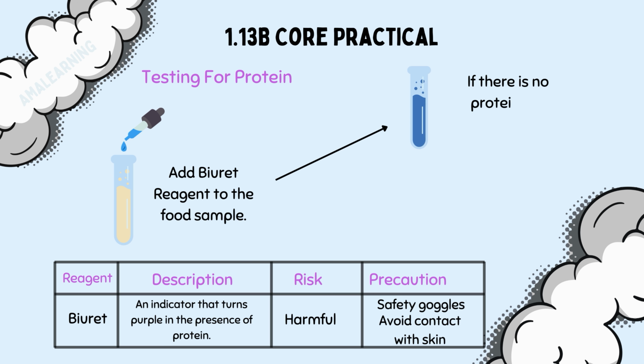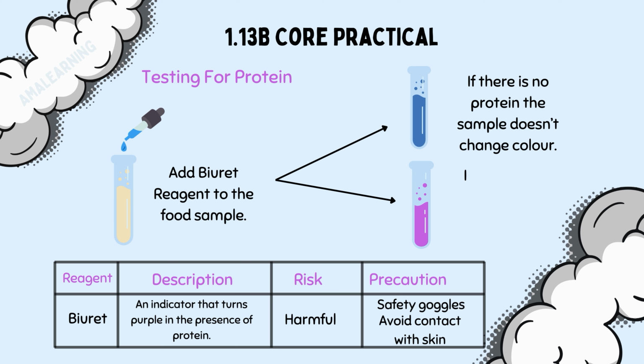If the sample does not contain protein, the color will not change. If the food sample does contain protein, then it will turn purple.